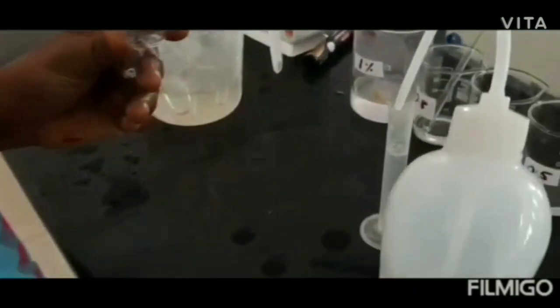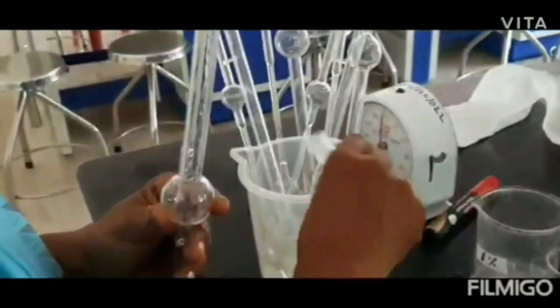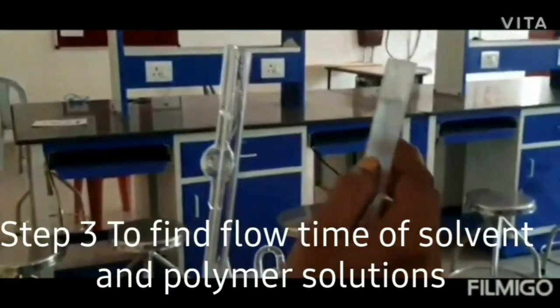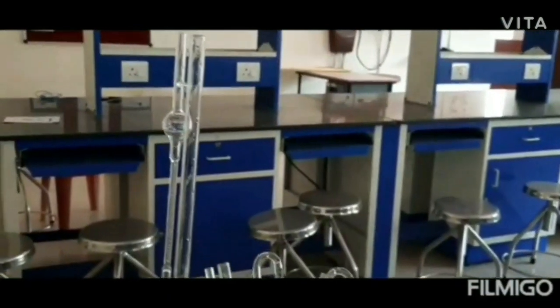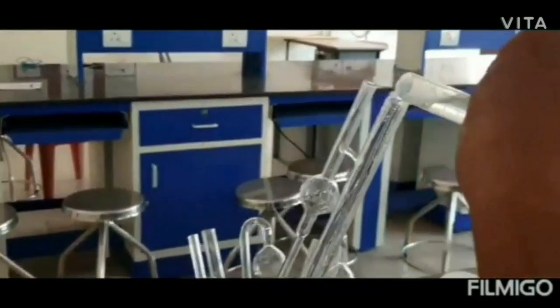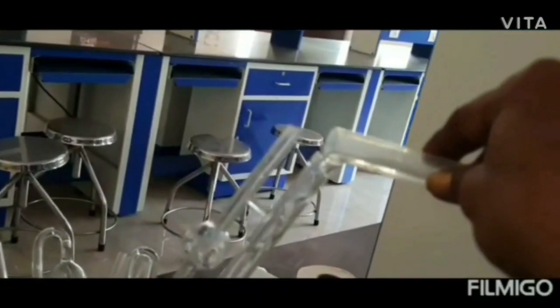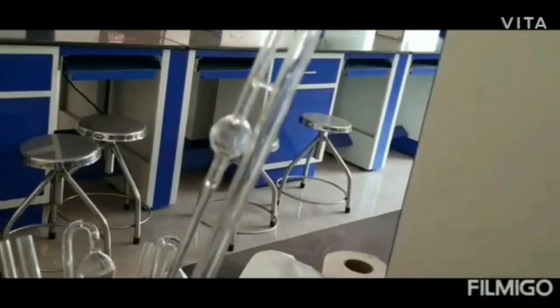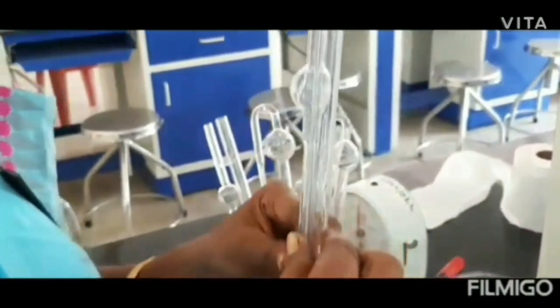So distilled water is the solvent with which the polymer solutions are made. So we need to find out the flow time first for the distilled water. So take 10 ml of the distilled water and drain it into the viscometer through the limb that has the wider mouth, just along the sides, in order to avoid bubble formation inside the viscometer.